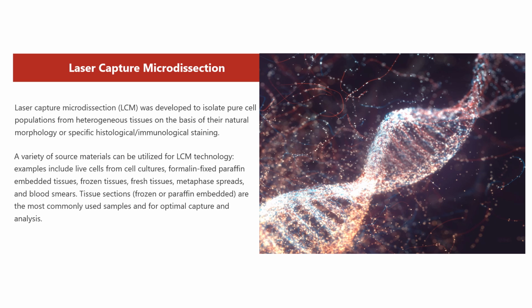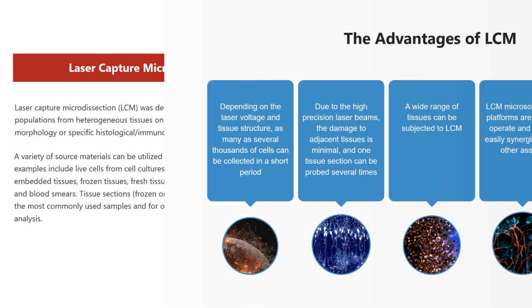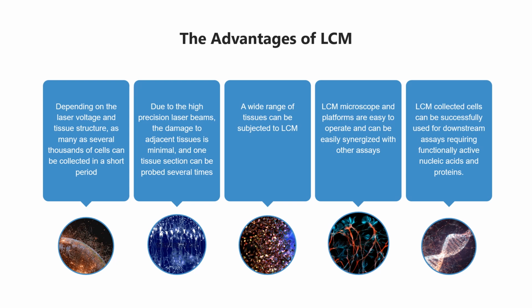LCM has enabled researchers to separate tumor from healthy tissues, stem cells from stroma and epithelial cells from parenchyma with high precision. Coupled with high-precision surgery techniques, LCM can even be used to isolate single cells. LCM has the obvious advantages of being high throughput, precise and adaptable to different tissue sources and applications.